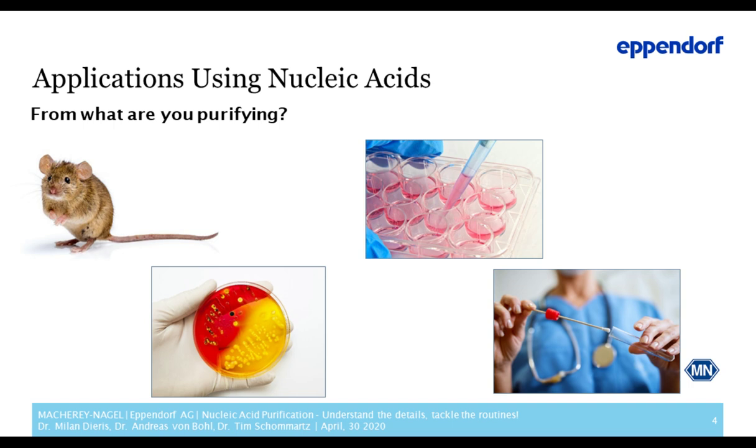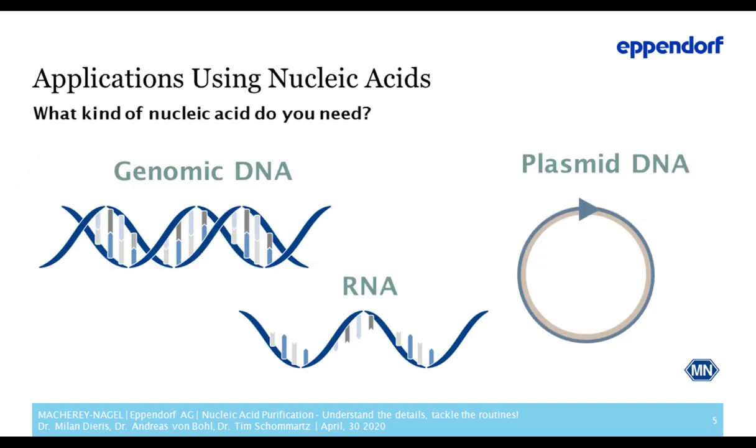Gram-negative bacteria like E. coli are usually no problem. But there are also some nasty, hard-to-lyse bacteria like Staphylococcus, where we really have to assist the lysis either enzymatically or mechanically. So always be aware of the kind of sample material that you're purifying from.